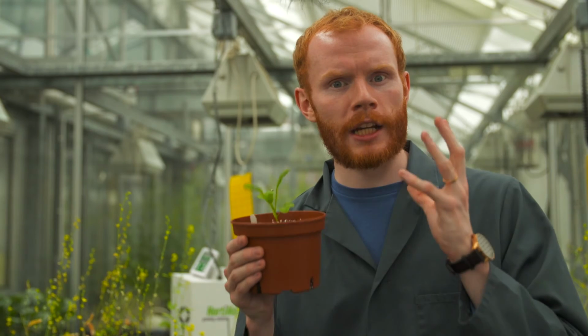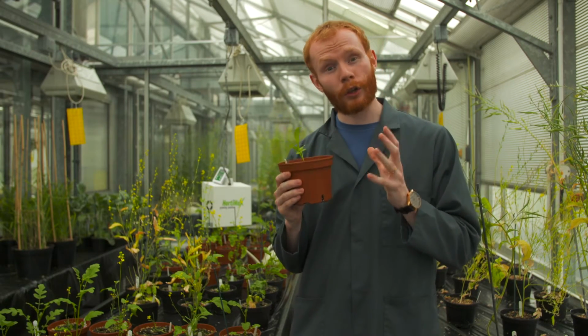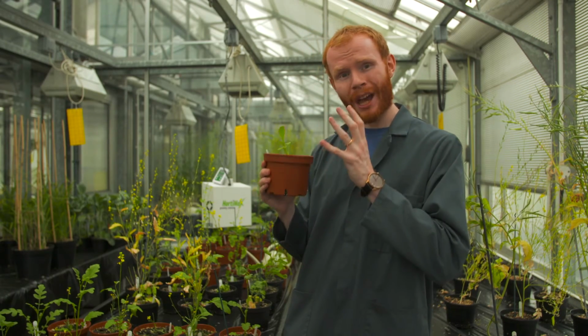So, we've demonstrated how gel electrophoresis can be used to analyse the DNA from plants that have undergone CRISPR-Cas targeted gene editing. This technology has the potential to revolutionise plant breeding, allowing breeders to produce bigger, better, hardier crops at a much greater speed.